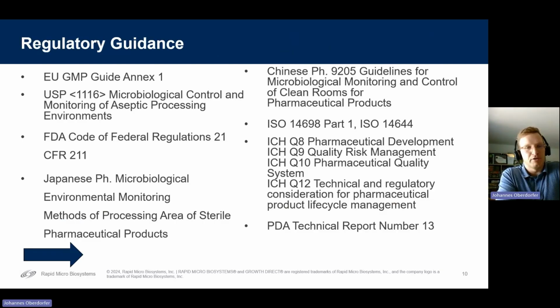There are multiple regulatory guidances. We can go through all of these, but it definitely shows that there is not a harmonized, one-size-fits-all, holistic approach. There are so many guidance documents that give guidance, but none that state, okay, if you go with this and that, then you're all done and everything's fine and everyone will approve.